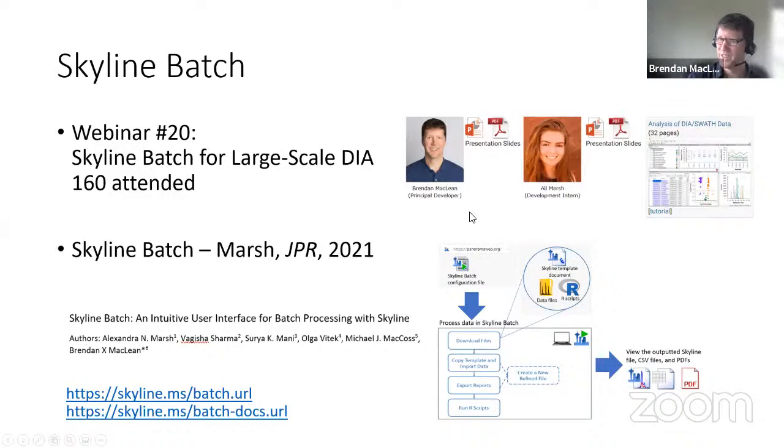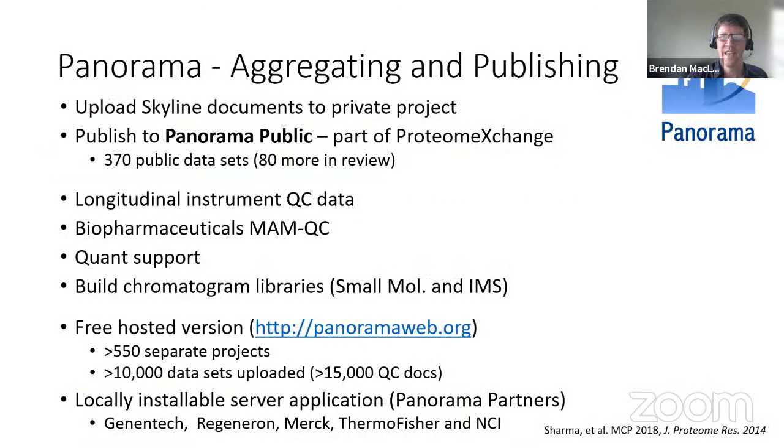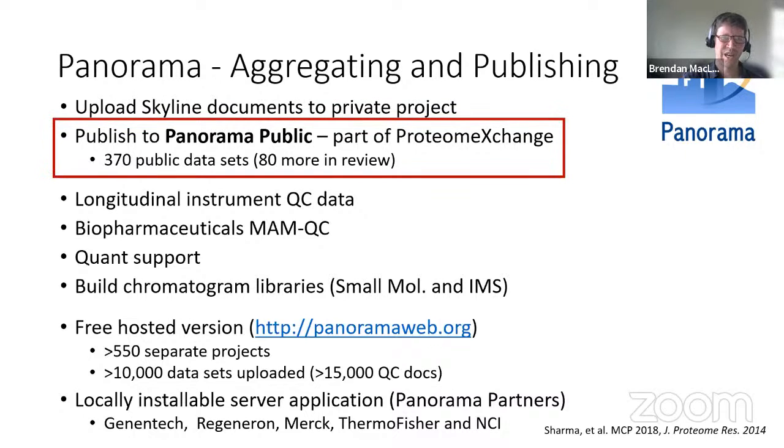But yeah, so we're going to learn how to use Skyline Batch here. It's a great tool, especially if you want the full power of running Skyline in batch mode without writing scripts. That was the goal. And then we're also going to be looking at Panorama, which was another part of the growing Skyline ecosystem, and introduced in, I think, around 2013. It's coming close to being 10 years old as well.